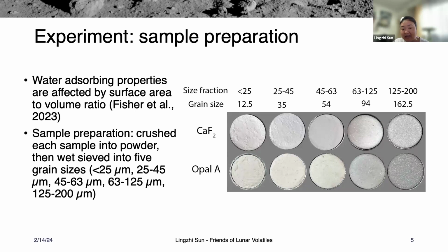Paul and I measured the water content of the newly opened Apollo 17 core 73001. We put this same instrument inside the glove box at the GSC, and there's no absorption.